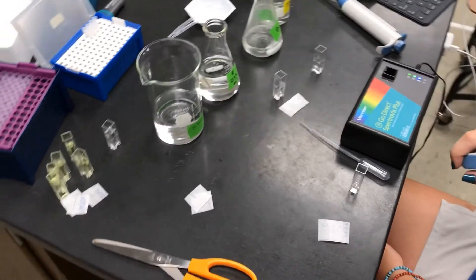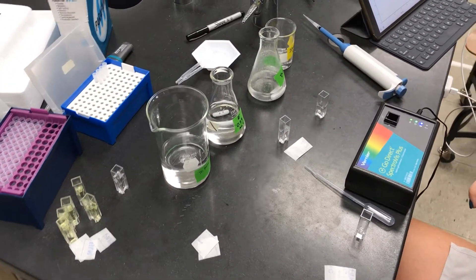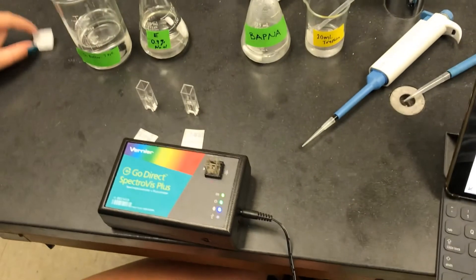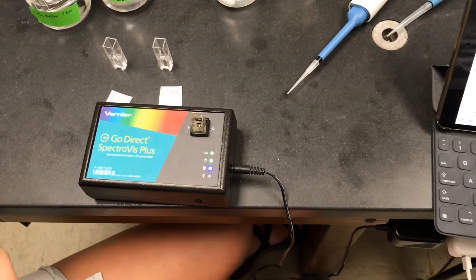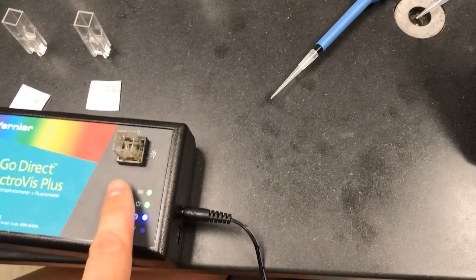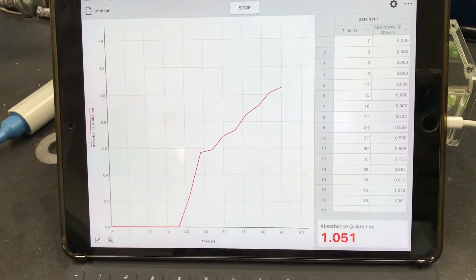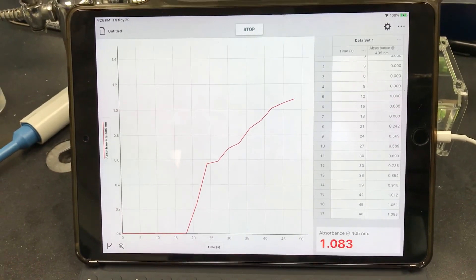We've got the buffer and salt in the cuvettes and now we're adding the substrate and enzyme. Here's what the final result looks like — you can see it's very yellow. Annie just put in the BAPNA and the trypsin, placed the cuvette into the spectrophotometer, which is now interfacing with our iPad and collecting data over time. We're going to let this run for five minutes and record the results.